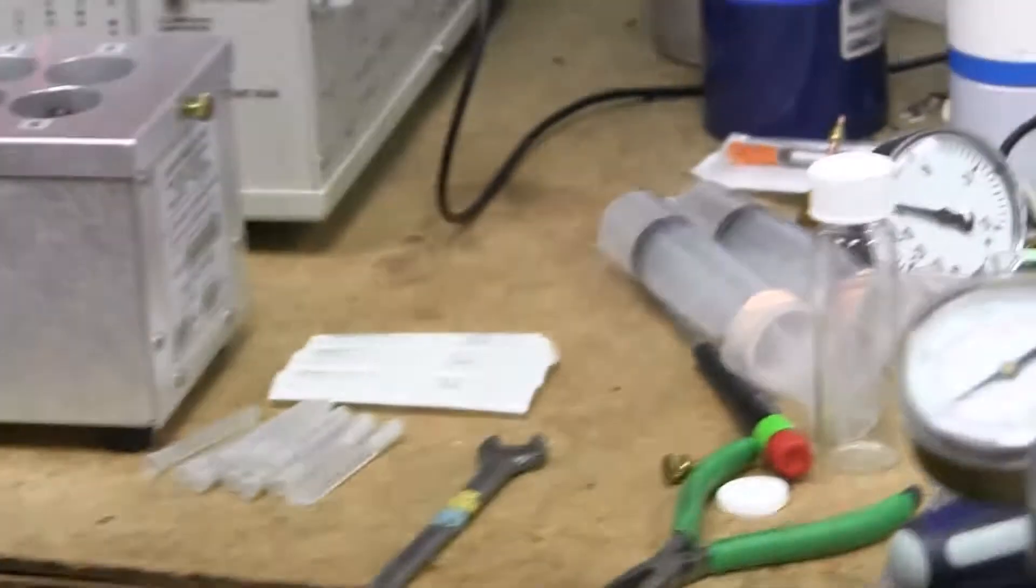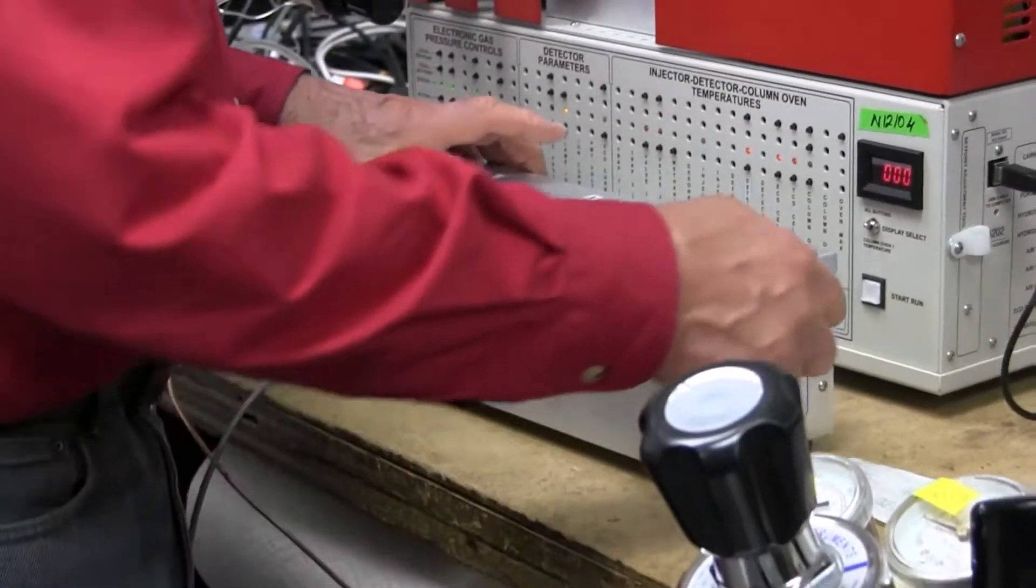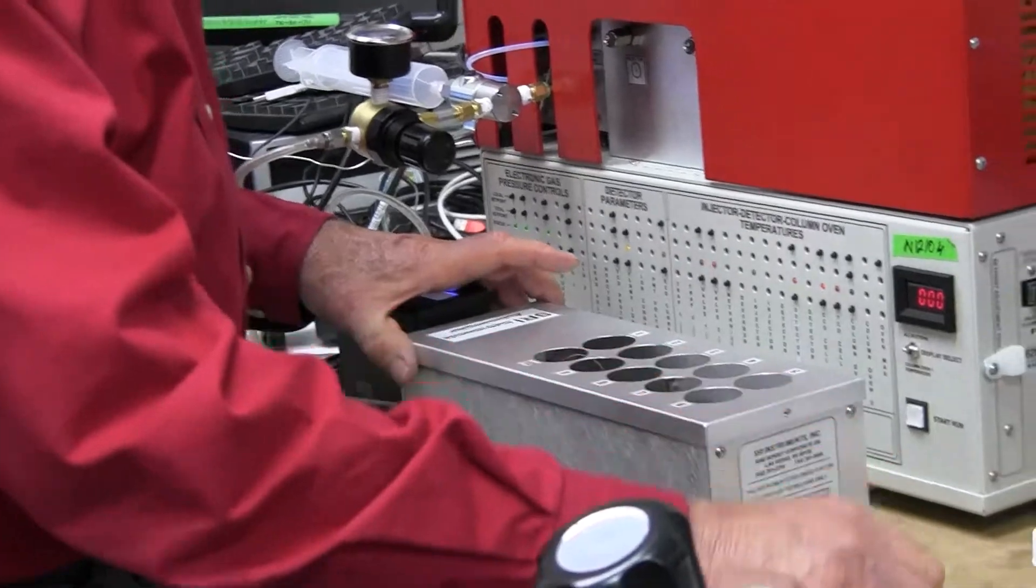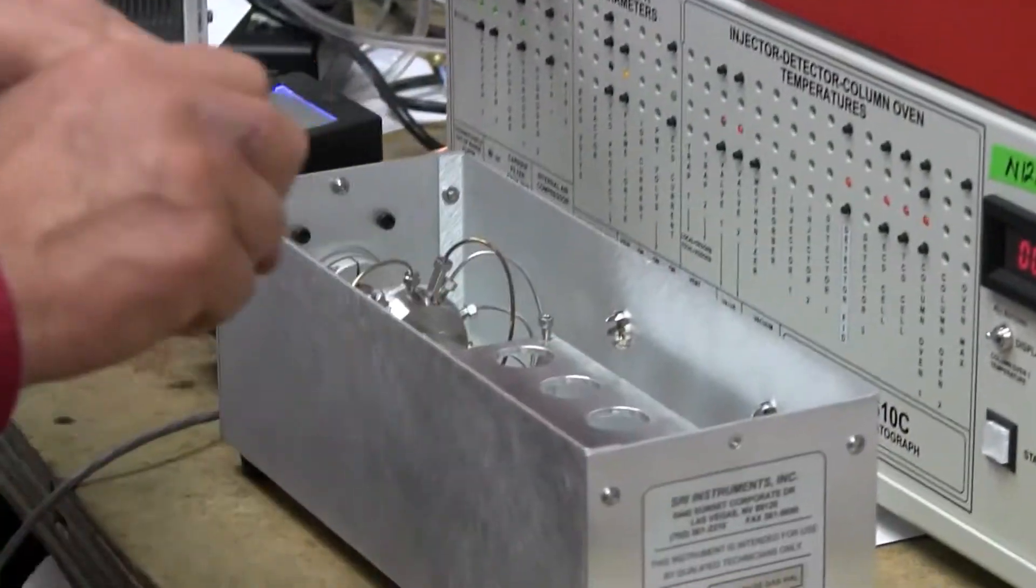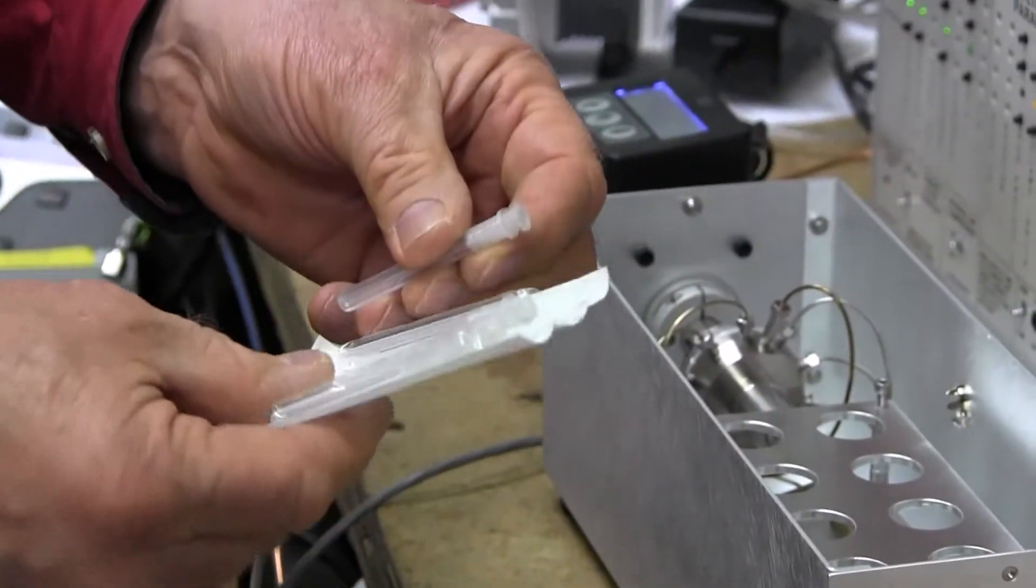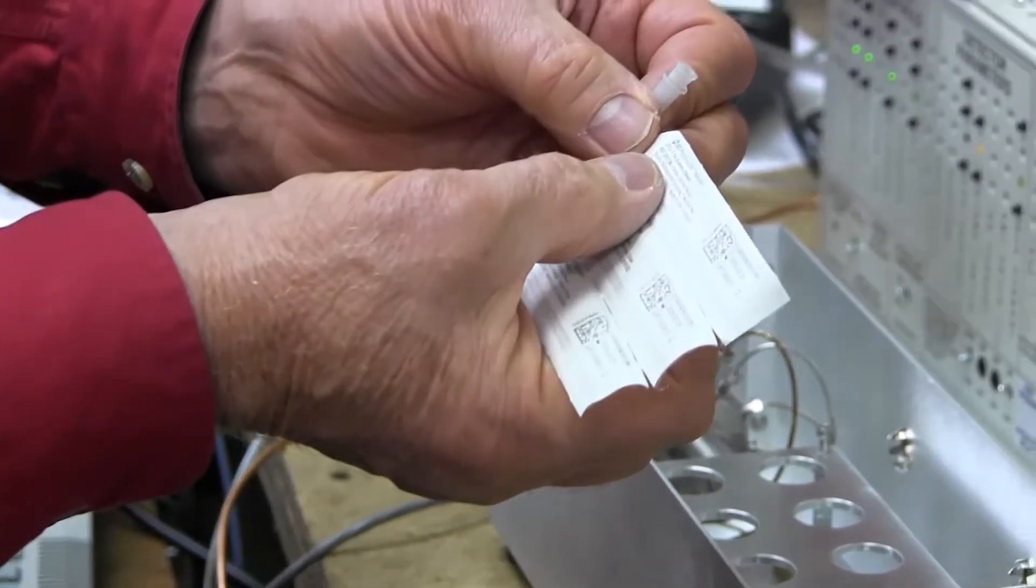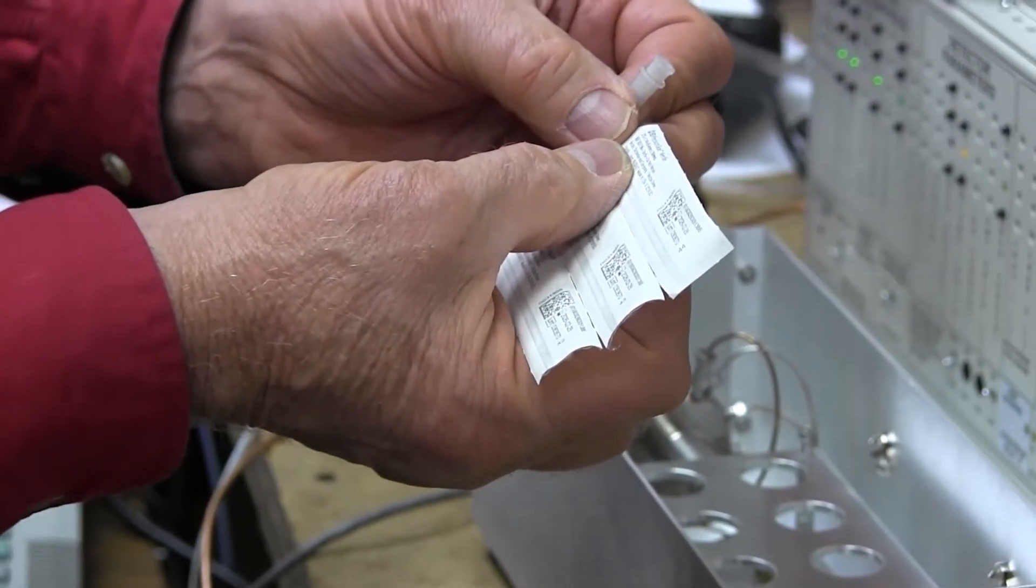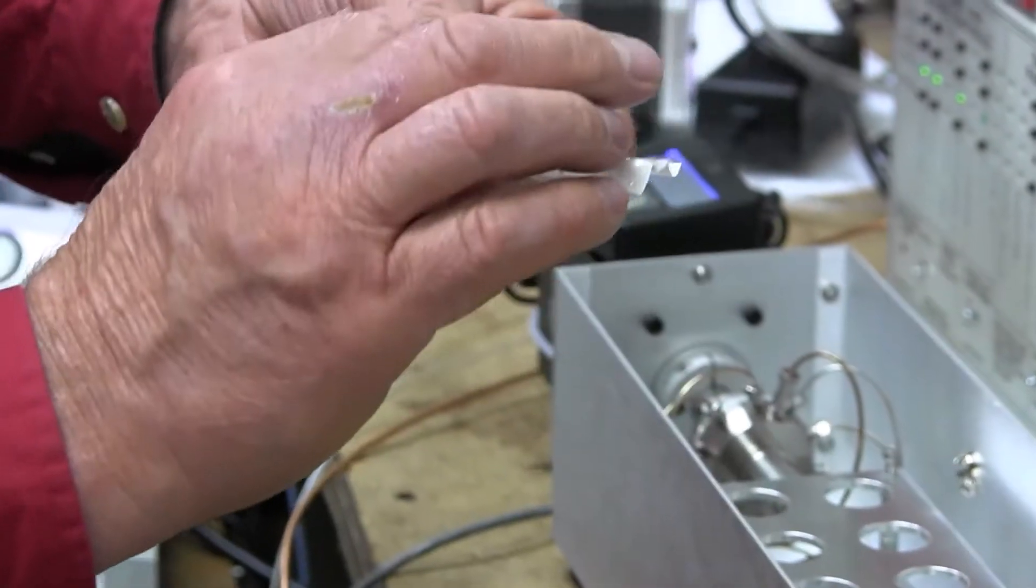Now, we ship it without the syringe needles installed just for safety reasons. So to install the needles, we take the top off, and then these syringe needles, we're using 27-gauge, 1-1/4-inch syringe needles. There's the BD part number, but it's 1-1/4-inch long, and these are about 20 cents each.